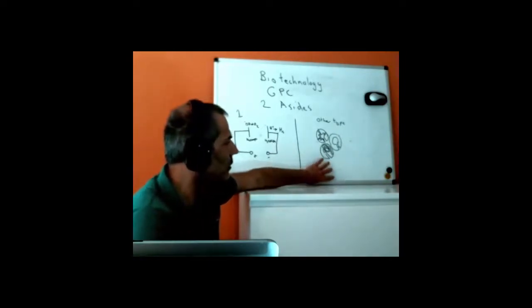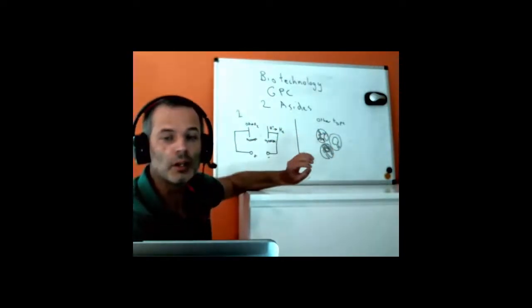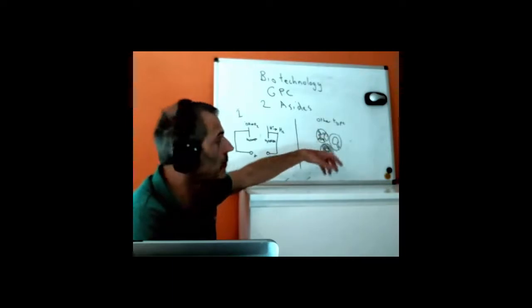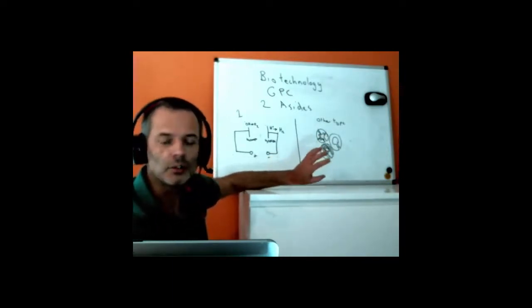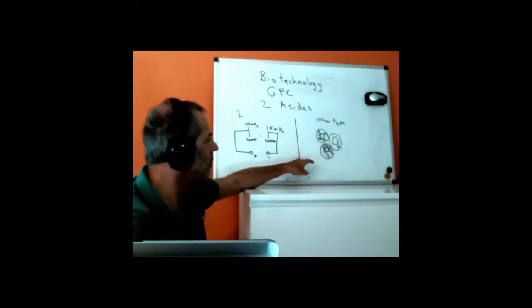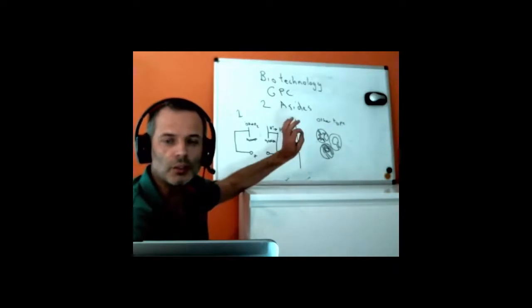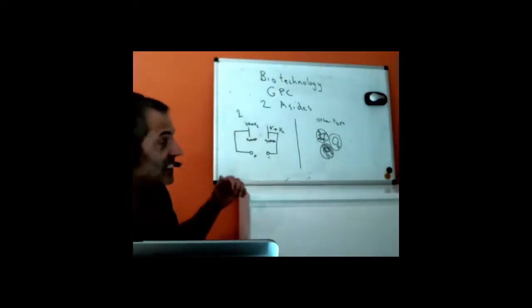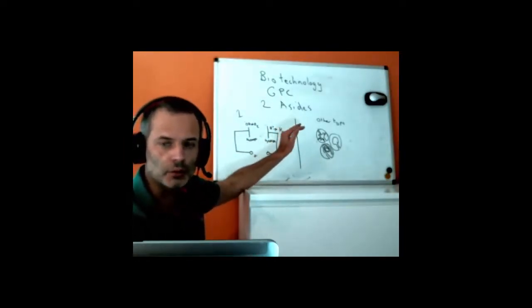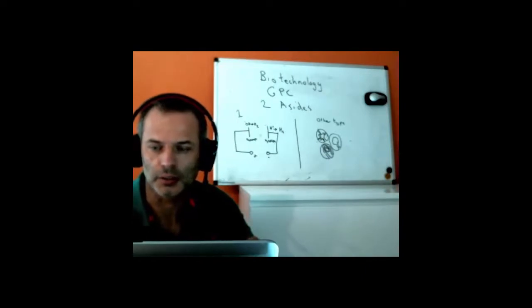What this means is if we have a big molecule coming along, it can't get in, and so it doesn't go inside, and so it passes straight through the column and goes out the end. If we have a small molecule, it can go inside and get lost. The medium-sized molecules struggle to get inside, so they don't go very much inside. We're measuring effectively the amount of time that the molecule spends inside the bead, where it's not moving, and the amount of time that it spends outside the bead, where it's moving at the speed of the liquid. The end effect of that is exactly the opposite of what we have here, that the long molecules, the larger molecules, go through faster, and the shorter molecules go through slower. That is what I find confusing about those two techniques.